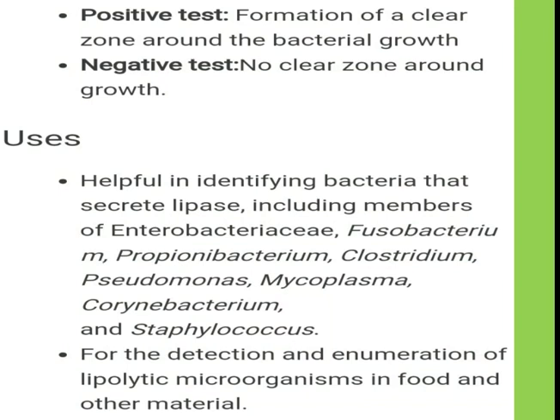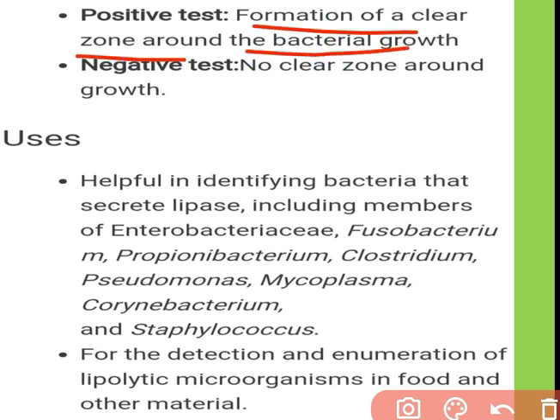The interpretation of the test: the test is positive when a clear zone forms around the bacterial growth. This shows a positive test, whereas no such clear zone around the growth shows a negative test.